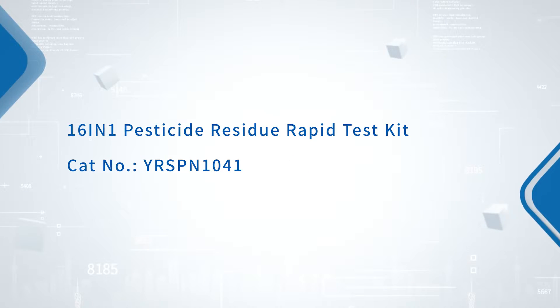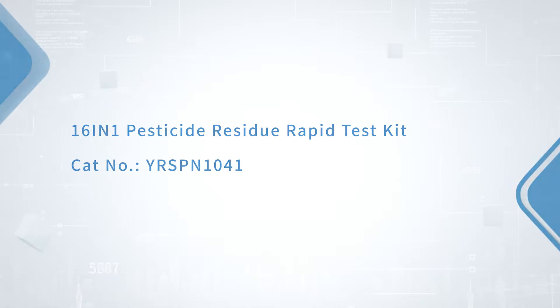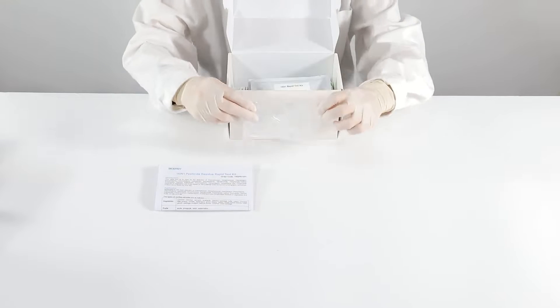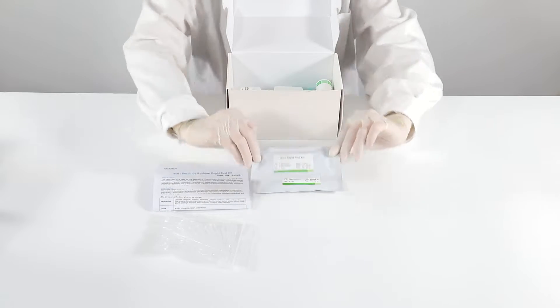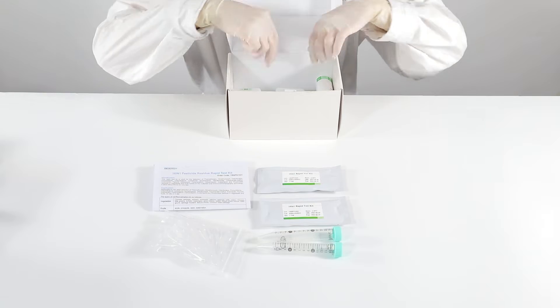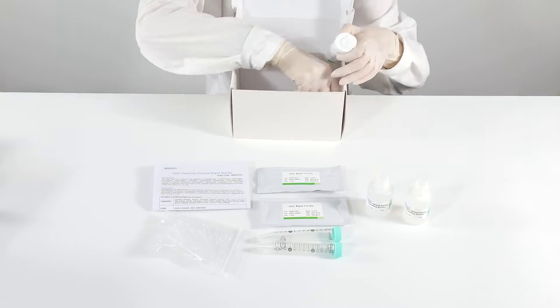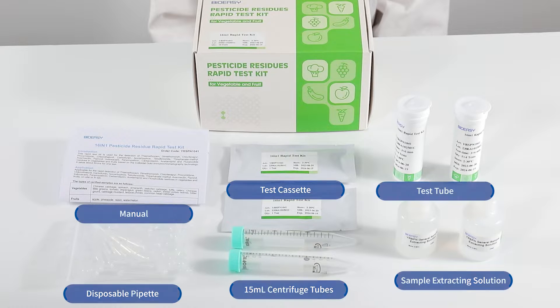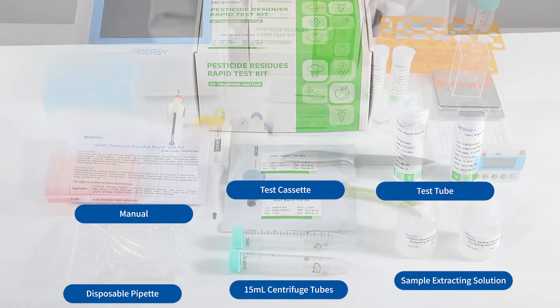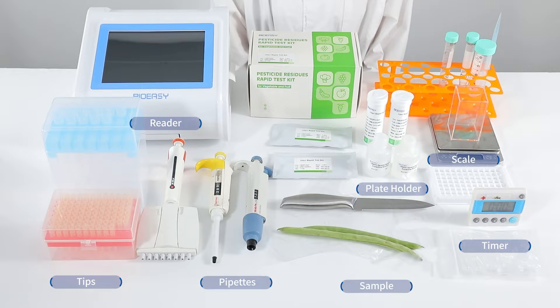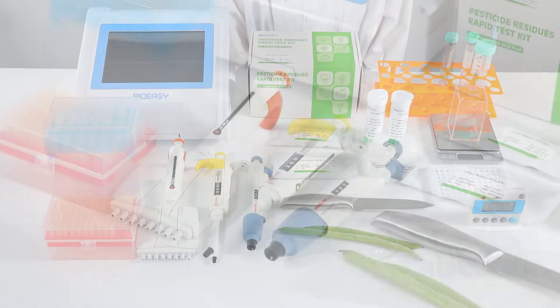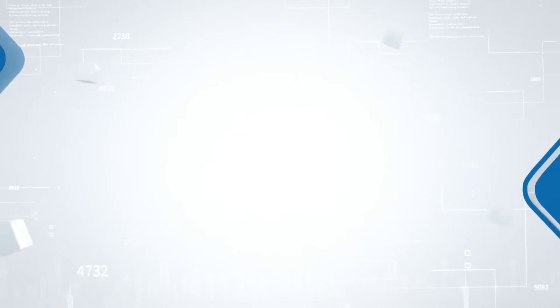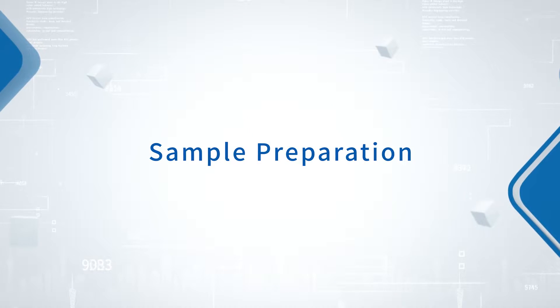16-in-1 Pesticide Residue Rapid Test Kit. Test Preparation. Sample Preparation.